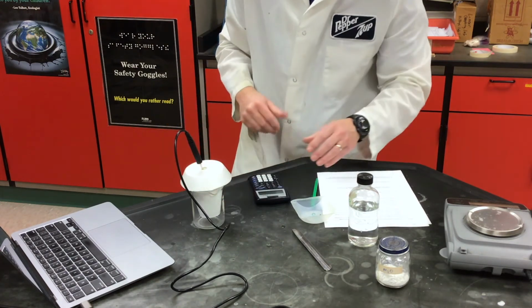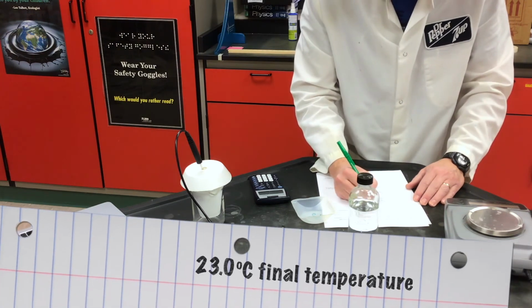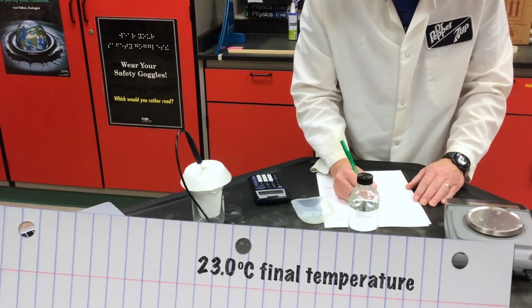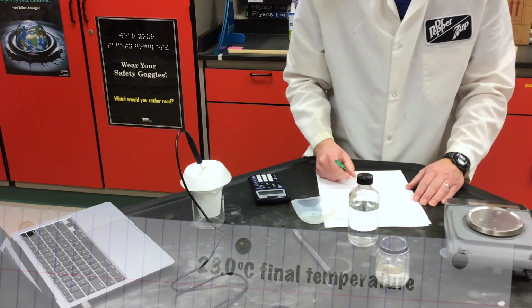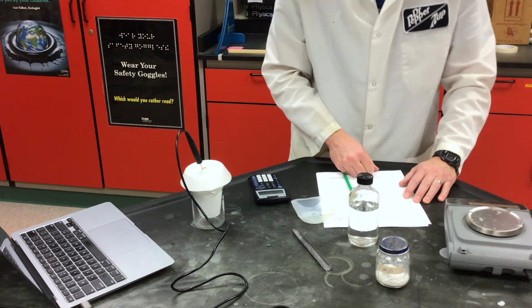All right, I'm gonna call it 23.0 is my final temperature, and that's what I'm gonna record on my data table, and I will go through and work all these calculations with you so you can kind of see what is happening for this lab.